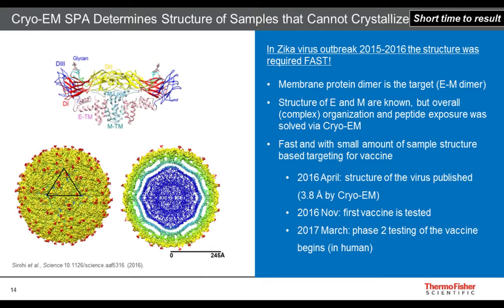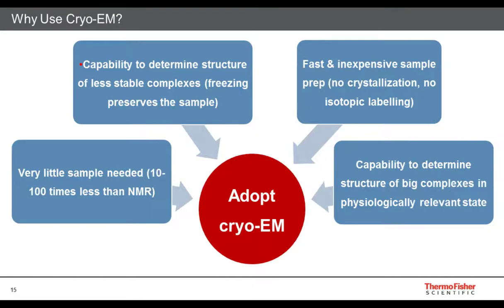So thanks to Cryo-EM, you can say that the process of developing a vaccine has been accelerated, and hopefully when the next outbreak of Zika comes, there is actually a final solution for it. And similarly, of course, there are more stories along the same lines of what I mentioned here, maybe with respect to Ebola, maybe with respect to HIV. So Cryo-EM really, from an application point of view, is showing that it is capable of moving the needle, of shifting the boundaries of knowledge.